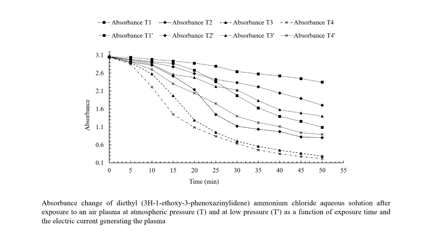In this type of plasma device, processes of dissociation of oxygen molecules from the air are carried out into atomic oxygen radicals, which recombine to form ozone molecules. These molecules, in turn, can form other free radicals, contributing significantly to the degradation of the compound of interest. The decrease in the air inside the reaction chamber inhibits the discoloration of the dye of interest due to the decrease or low presence of ionizable gas in which the different primary chemical reactions are carried out.